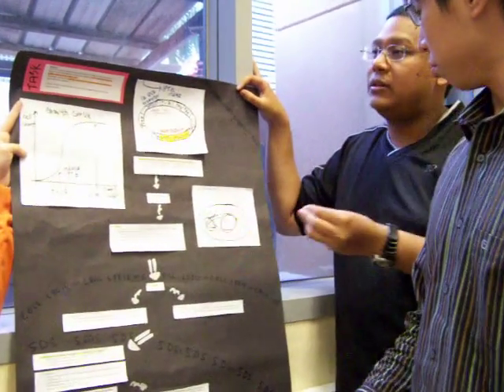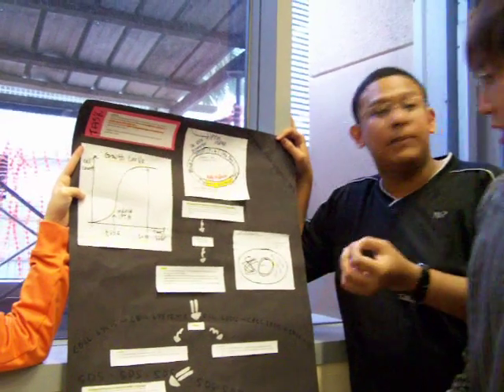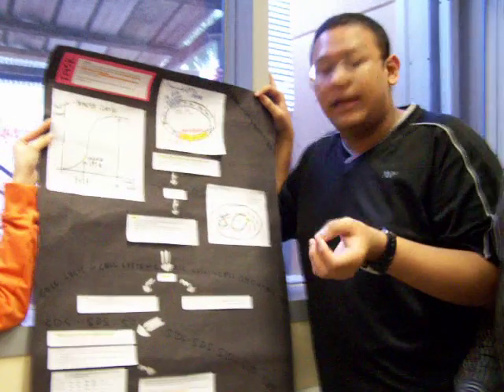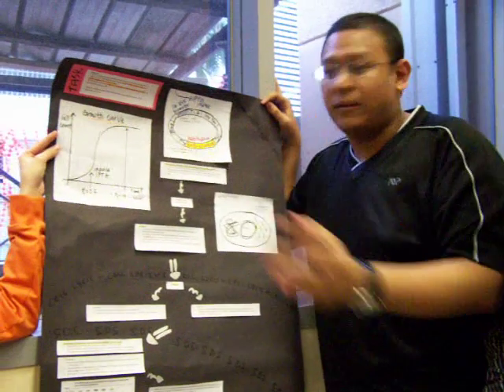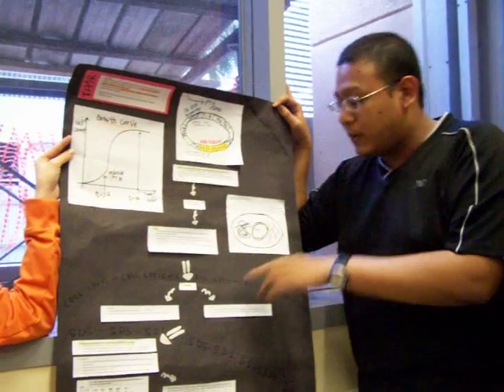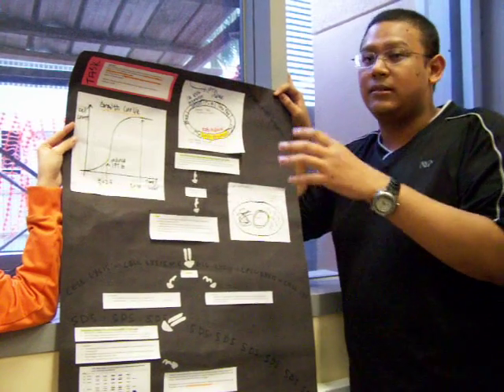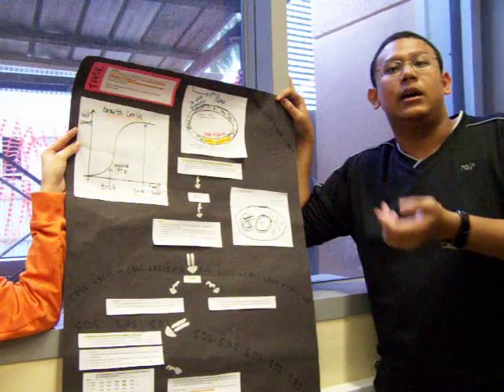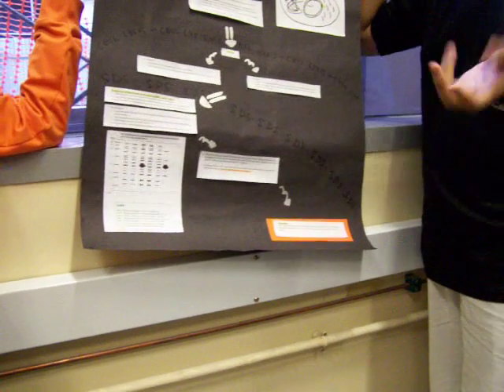So when you actually, then what we basically do is take a small sample at the end of this point, then we lyse the cells up. Then we collect the pellets and the supernatant, we separate them out, then we carry out SDS-PAGE. That step is done to test whether our protein is soluble or not. And when we do that, we found out that it's in the pellets, so it's insoluble, it forms inclusion body.